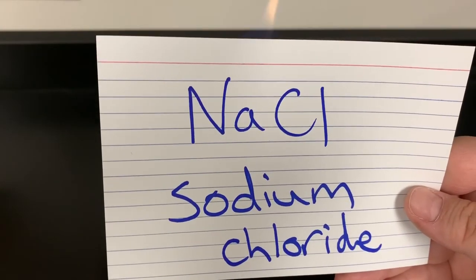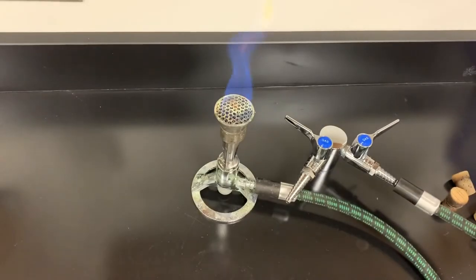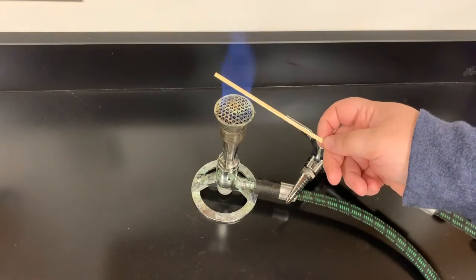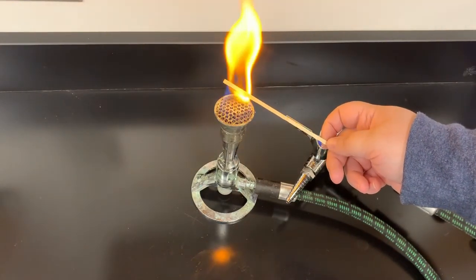NaCl, sodium chloride, is next up — just plain old salt. Sodium turns it a bright orange.